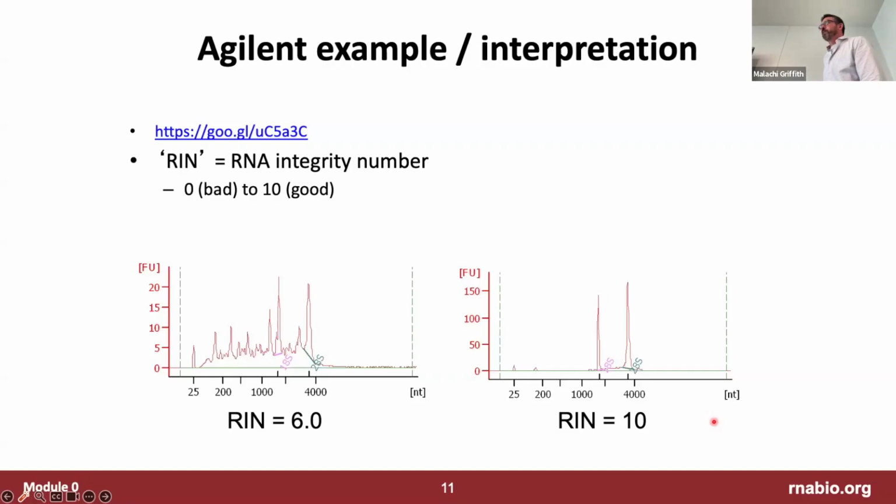And this is a follow-up to that. Many of you are probably familiar with the Agilent Bioanalyzer, or one of its competitors, or other trademark names. Essentially, it's a gel electrophoresis instrument that runs samples through a gel in a capillary so that small nucleotides come through more quickly and larger nucleotide molecules come through more slowly. There's a detector that reads off these molecules as they're coming through, and it gives you a kind of readout over time. So it runs over a period of 5 or 10 minutes, and then gives you this readout that tells you what size are most of my molecules. Are they mostly of one size, or is there a lot of different sizes, and what's the range of that size?